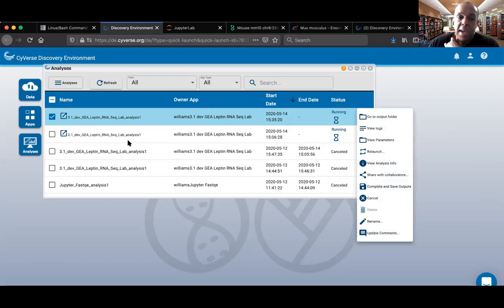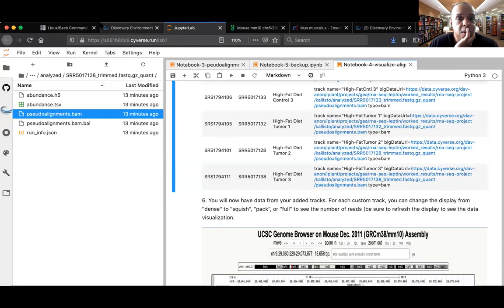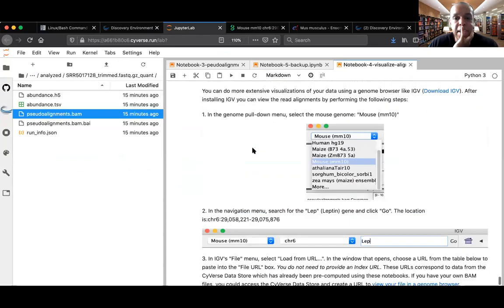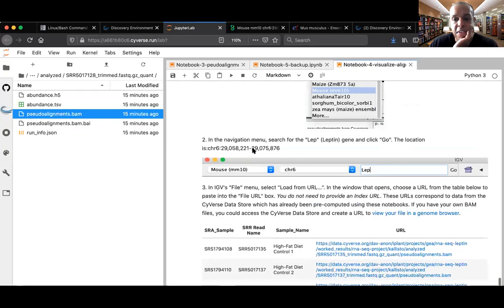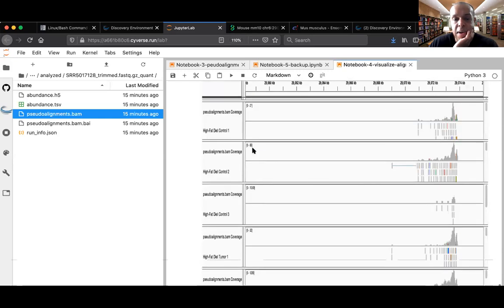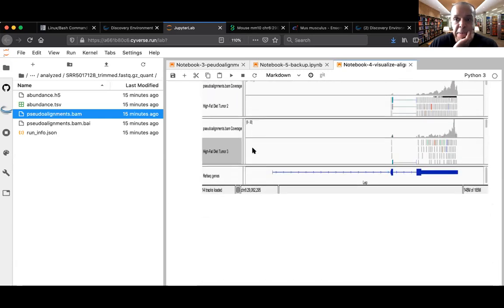Then when you come back here, there'll be a link to those files so that you could export them, or you could send them to a Genome Browser. They will end by themselves after 2 days, and you won't lose your data. It'll automatically write it back to your Cyverse account. There are also instructions back here on using a separate standalone tool, popularly called IGV, which you could download to visualize these data in a different way. It's pretty cool, so I invite you to explore it.